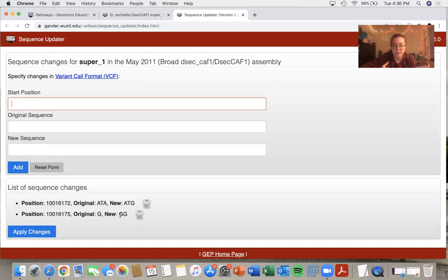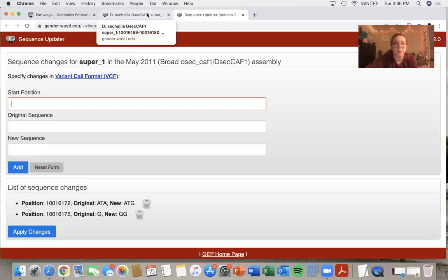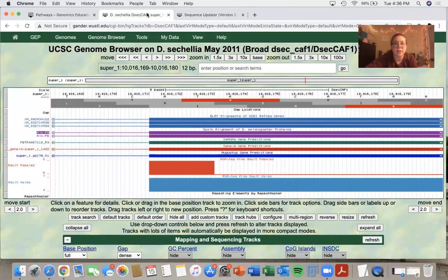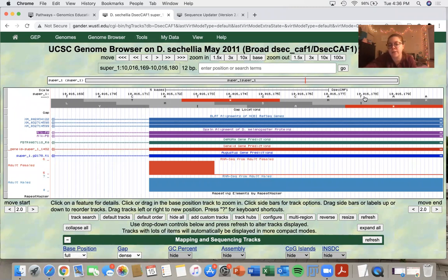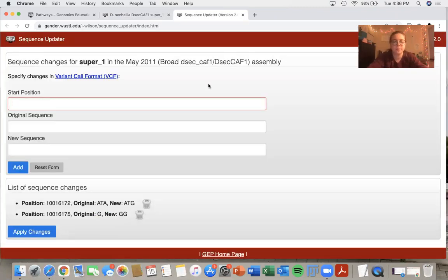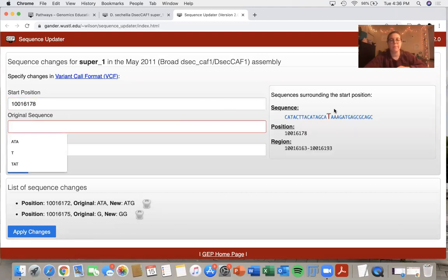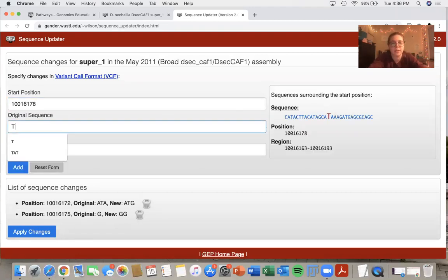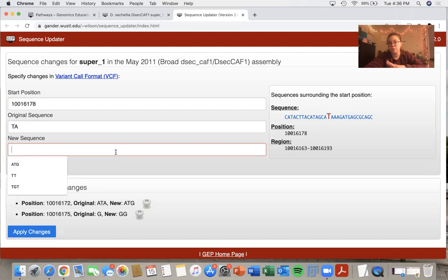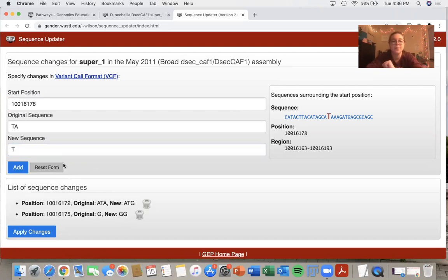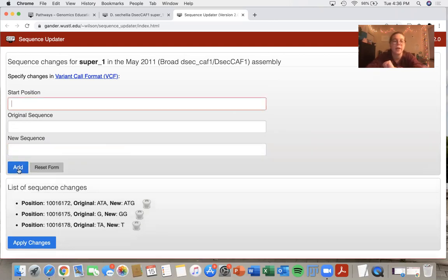So the next change that I want to create is a deletion. Say I have a sequence at 10,016,178, that is T and then A. So I'll go here. I can see that my T is highlighted. So my original sequence is T, A. And for some reason, I thought that the A was not correct. I would just want to submit a T and I would add that.